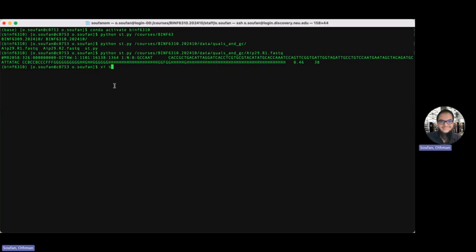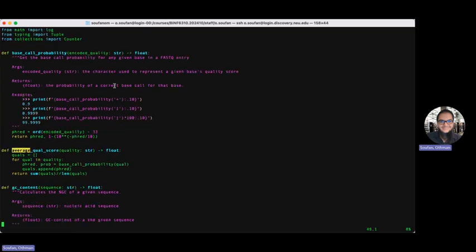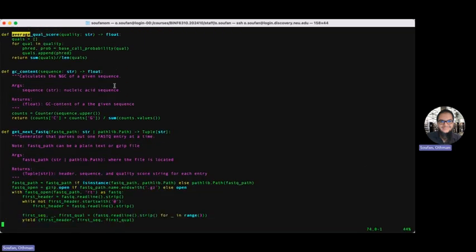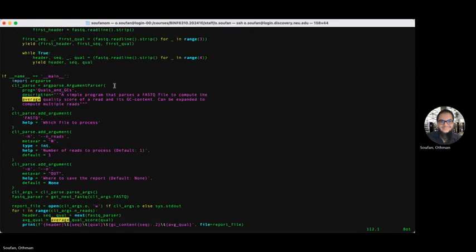Now, this is the program that we're getting. Let me go down. It's going to give first the GC content and then the average quality score.